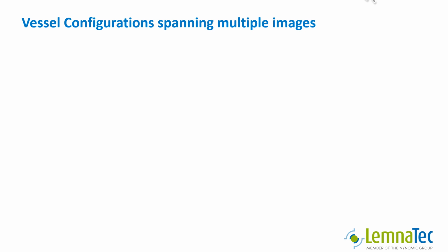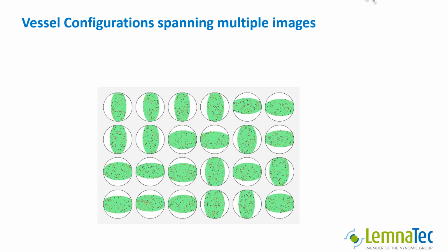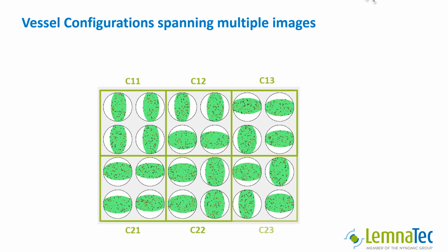The split scenario. Consider a microtiter plate with 4x6 wells, and we are using some kind of telephoto camera which covers only 2x2 wells at a time. Then we can define a common layout with 4x6 wells, but each camera picks only one part of it. This mode is called split mode because it splits the layout into pieces. The wells are named as usual from A1 to D6.